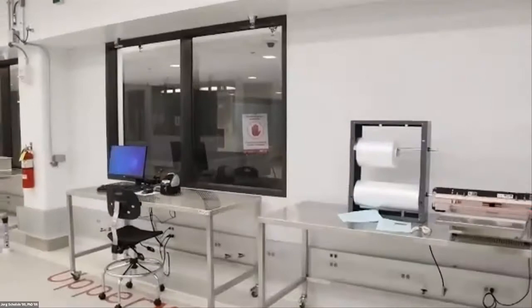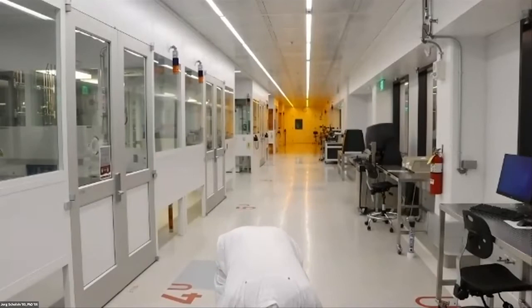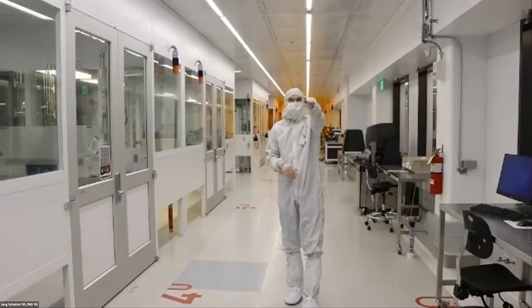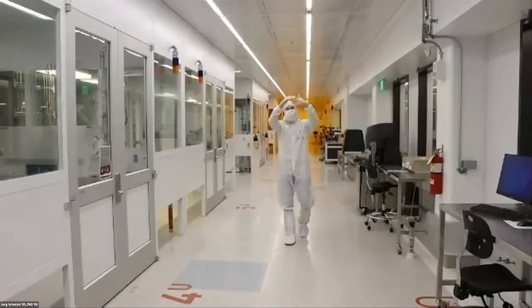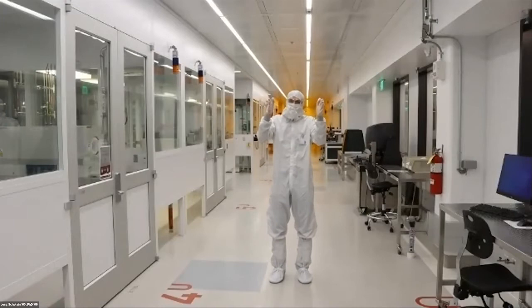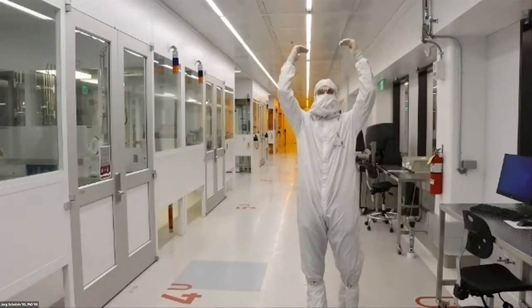It's always a hard part trying to get through doors with this massive tripod. But the nice thing is, in the clean room, doors are very slow. And they're very slow on purpose, because you want to make sure that you don't disturb the airflow. The fast door would create a whole bunch of whorls. A slow door doesn't do that. So we're now in the main clean room. We have actually the same structure on the first floor. Behind that direction there is actually the clean room elevator. If you look at the structure as we walk through, you'll see that it's essentially like an e-shape. And it's an alternating structure of what's called the bay and a chase. All the tools, all the users, if you do research, you're in a bay. The chase is essentially the structure where equipment maintenance can happen and where the infrastructure comes in.